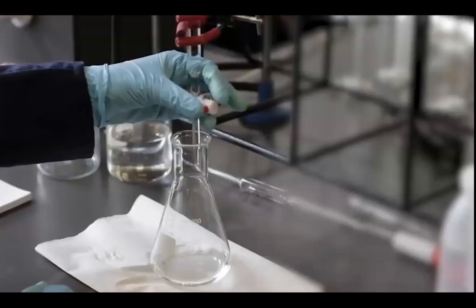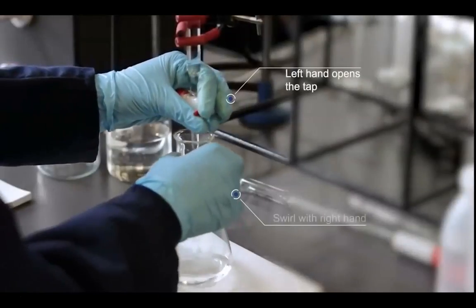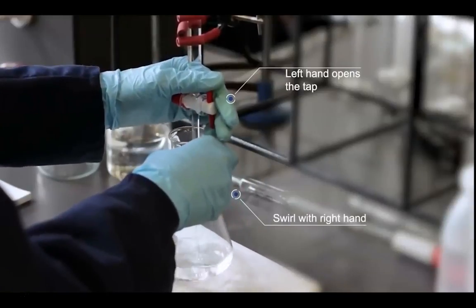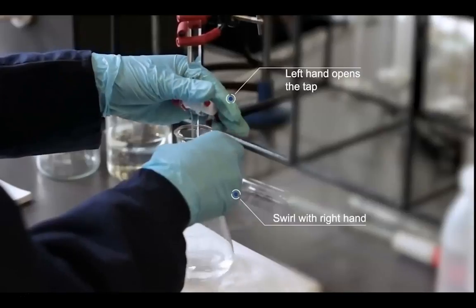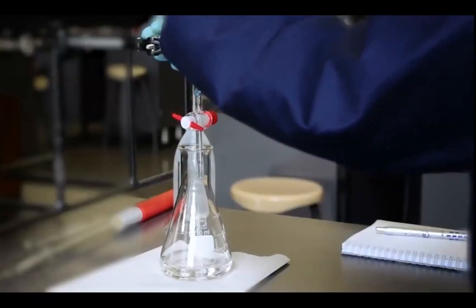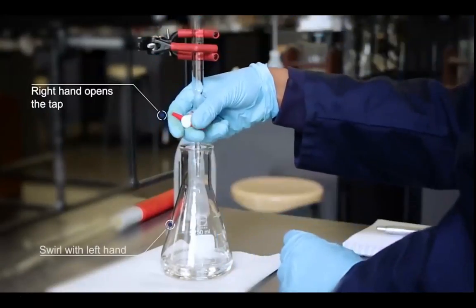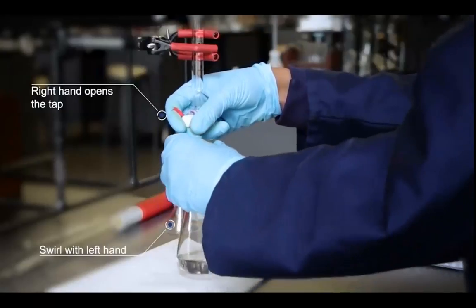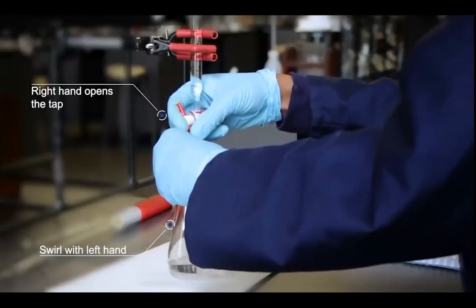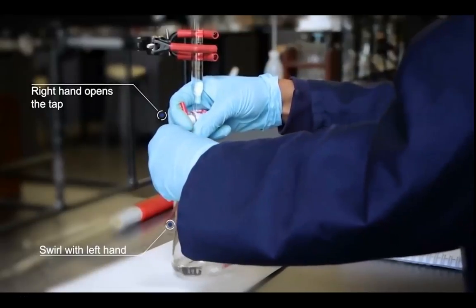Looking at this version now shows how to manipulate the stopcock or tap. If you're right-handed, your left hand will go around the stopcock like this, and with the right hand holding the neck of the flask, a little movement with your wrist causes a nice swirl. If you're left-handed, turn the burette around and manipulate it with your right hand. With practice, this method allows you to titrate constantly, slowly or quickly as you like, without having to stop and start frequently.